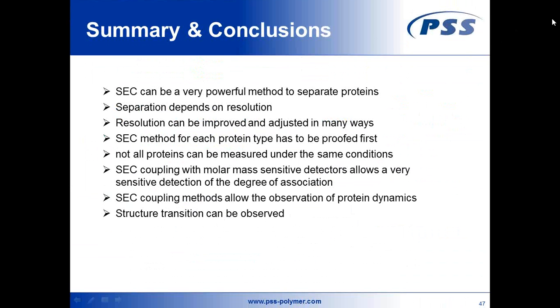Because obviously out of the viscosity experiment you can get the hydrodynamic volume, which also is an indication of the size in solution. So is there an advantage or disadvantage of using the viscosity detector over the light scattering detector, or the other way around?